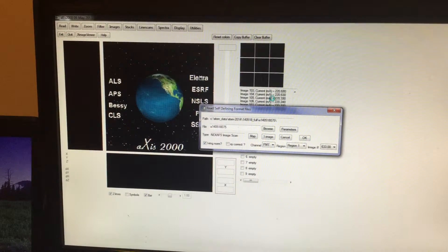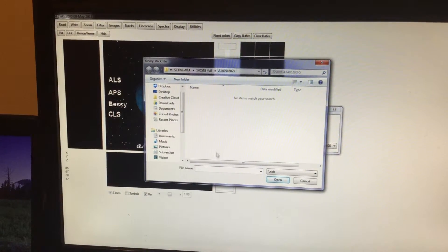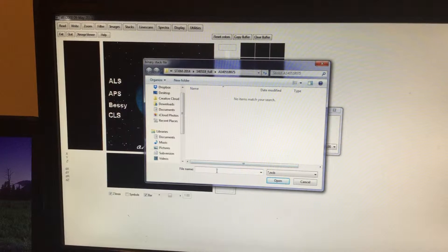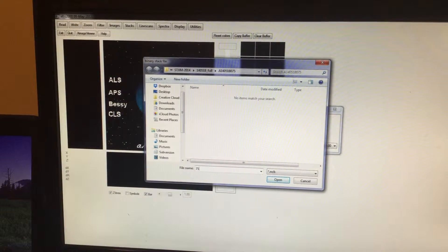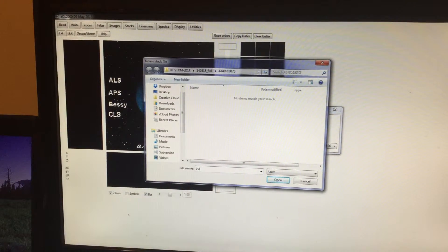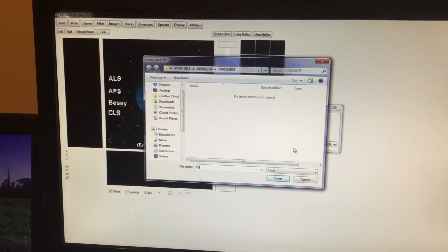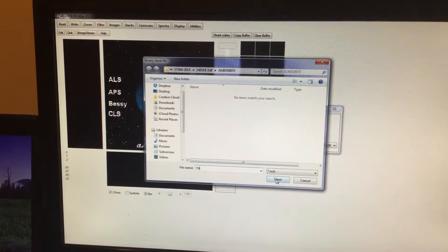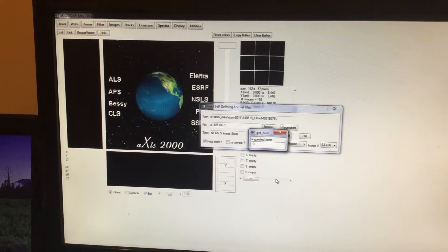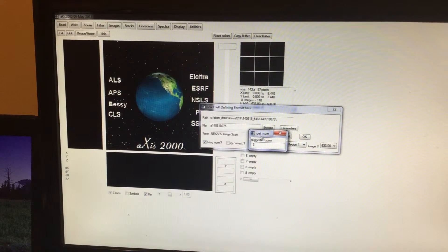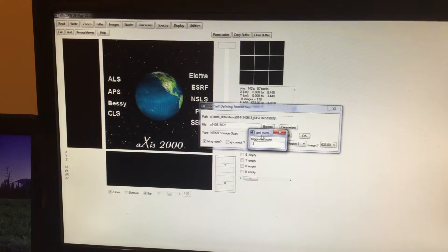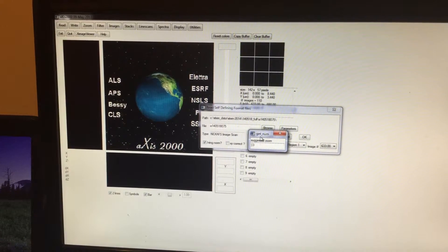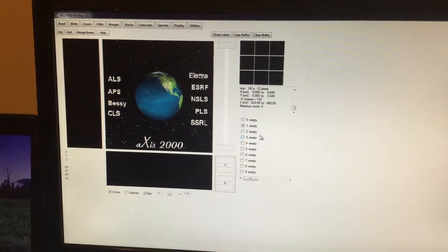You can see here the data is loading. This window will pop up, and I'm going to call this 75L, which means LCP. So click on Open.